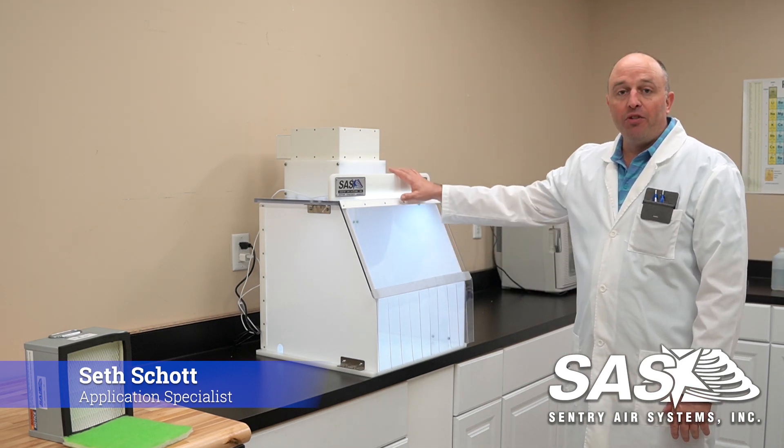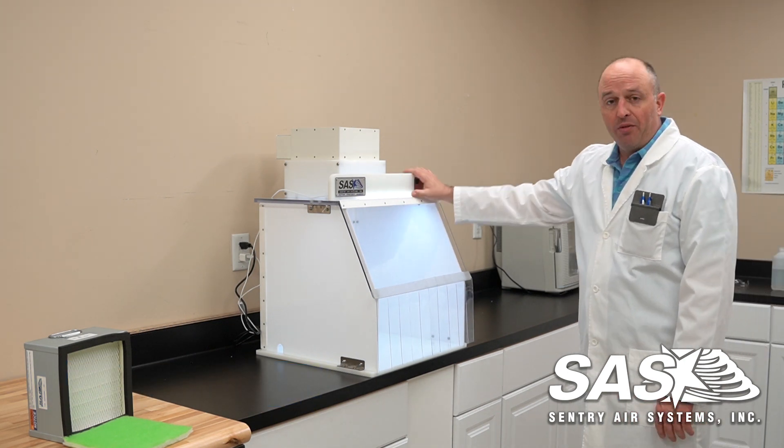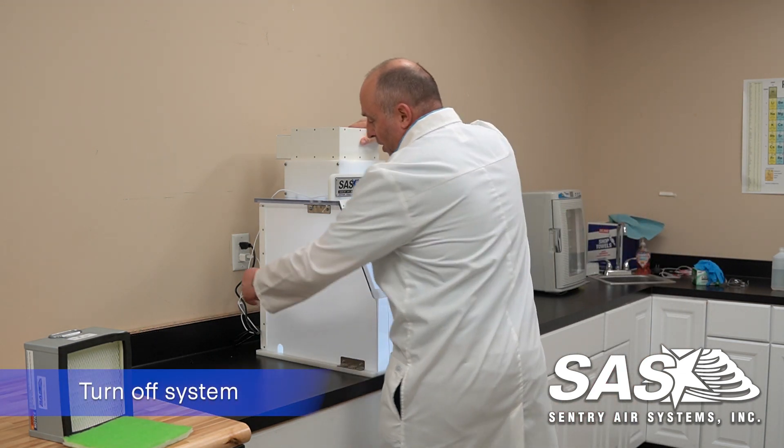Hi, my name is Seth and today we're going to be going over how we change out our filters here at Sentry Air Systems with our SS218 PCR. We have the unit here — it's running right now — so what we're going to do to be safe is we're going to shut it off, turn off the blower as well as the light.